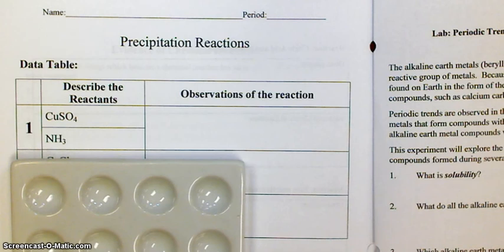All right, this video is for those of you who were not here the day that we did the precipitation reactions. There are 3 precipitation reactions that we did. We reacted copper sulfate and ammonia, and really there's solutions of both of them. And right out over here is where you're going to describe what the reactants look like. And then over here, you're going to describe what happens when you allow them to react.